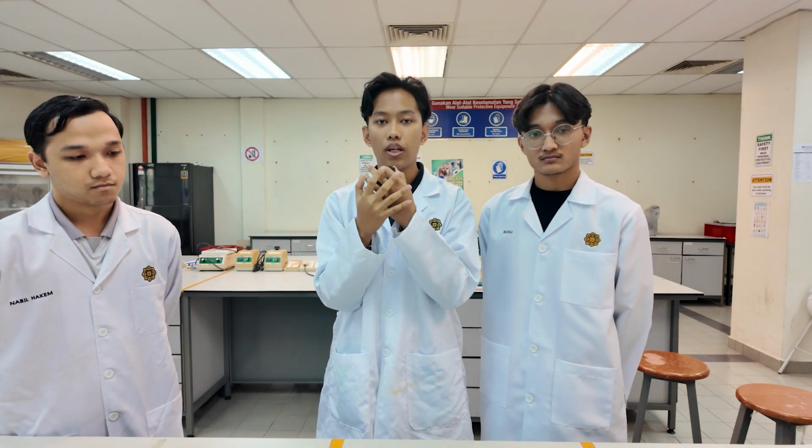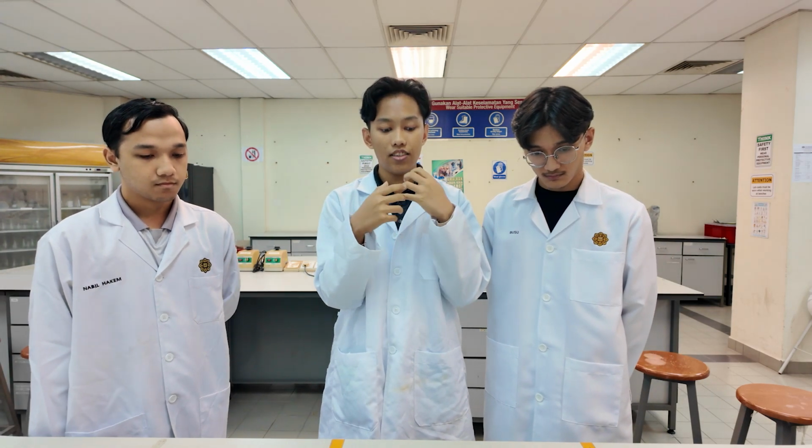However, some are not very efficient, very high cost, very expensive, and very time consuming. So here we can use TLC experiments to identify what we need. It is very cheap, a very straightforward experiment, and easy to do.